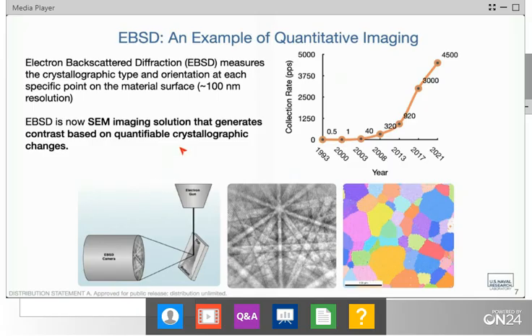And this increase in speed is something that has also enabled this, right? When I first started doing this, I was looking at how quickly we can collect points, and we're kind of still in that area of how many seconds per point versus points per second. And now with the advent of faster and faster cameras, the CMOS cameras that have recently come into fashion, we are indexing over 1,000 points per second. So that is highly advantageous.